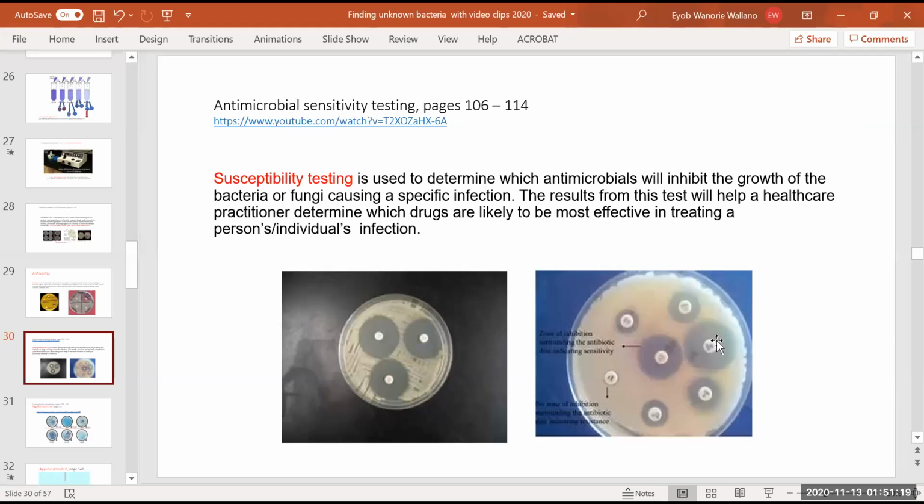So here you are saying this is broad spectrum. Now this is resistant. Do you see that? That is inhibition. And then susceptibility: the doctor is not going to prescribe medication like this one. If streptomycin is resistant, the doctor will not prescribe it, but may prescribe this one or this one. That is what we call the inhibition test, the susceptibility test. So the doctor prescribes that kind of antibiotic, maybe to take 3 times a day if it's an acute case. If it is not an acute case, maybe 2 times a day. You see? So to forecast this, you need to know how the inhibition test works.